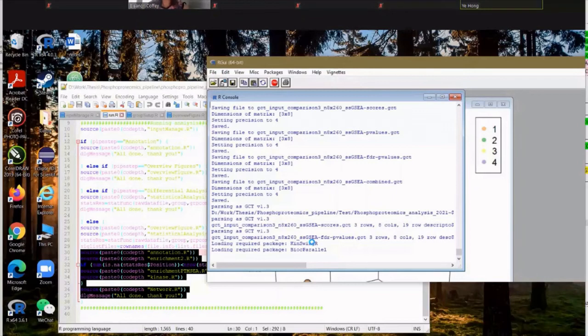It checks all the kinases available and checks their substrates, and there's a calculation for which substrates might be phosphorylated by which kinase. Then it checks which of your peptides are significant, and after that, it actually gets the fold change of all the significant peptides.